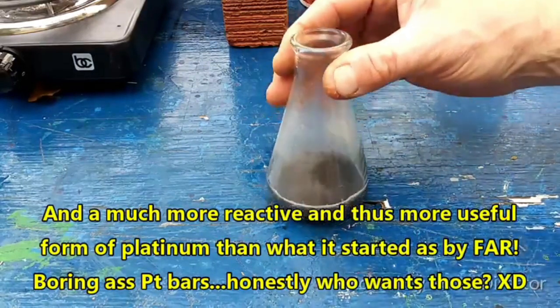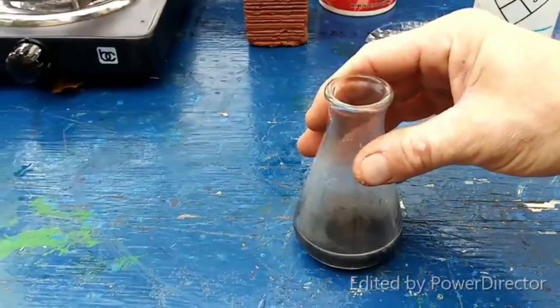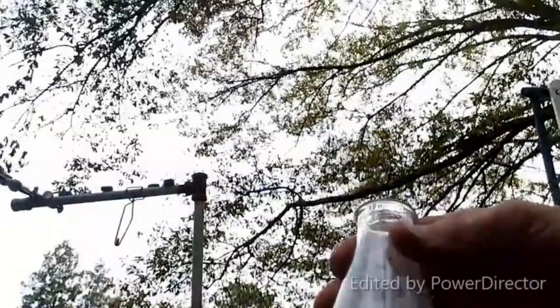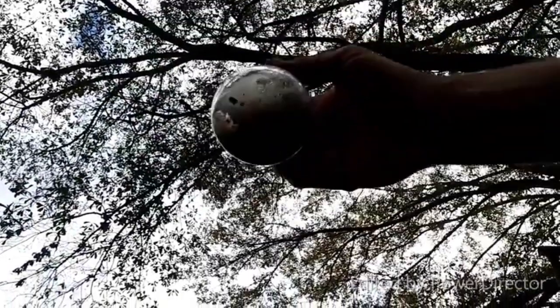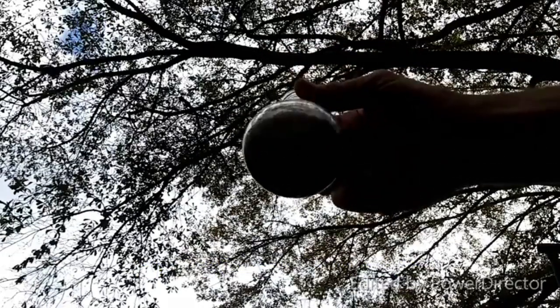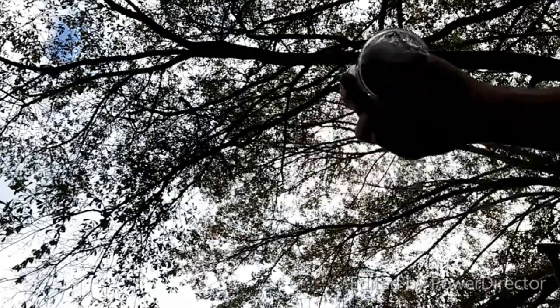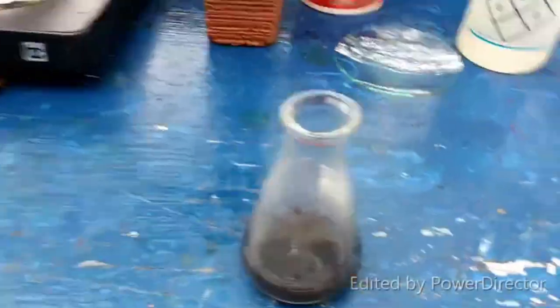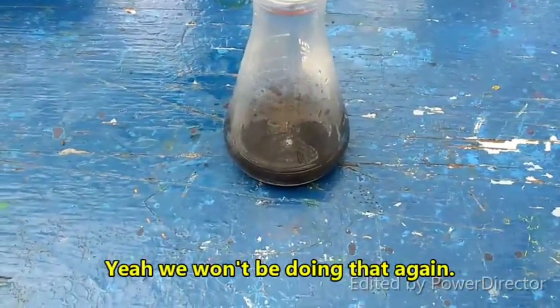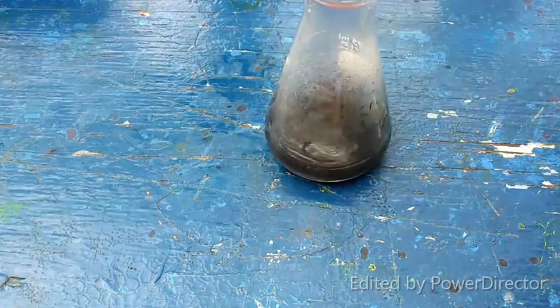Well, okay, this may or may not work out, but I don't even know if it's focusing, but I'm hoping you can see that there is no more of the bright yellow diammonium hexachloroplatinate left. So, yeah, that may or may not have worked out good. And if you wanted to see what the inside of my nose looked like, now you know. Hey, I don't expect you to take my word for anything, man. Okay? Try to offer proof.